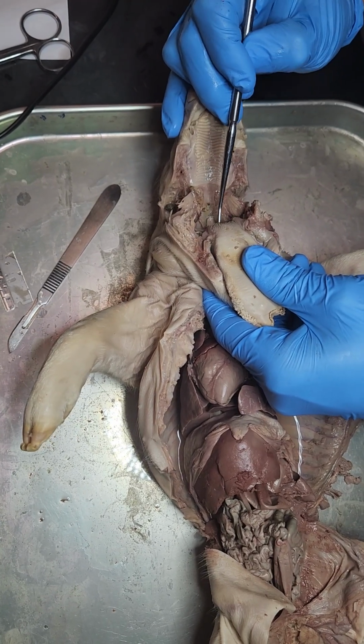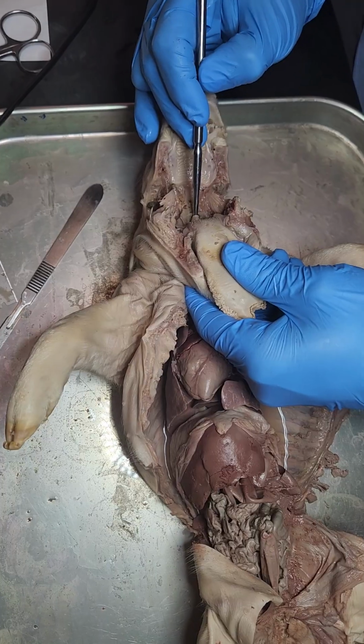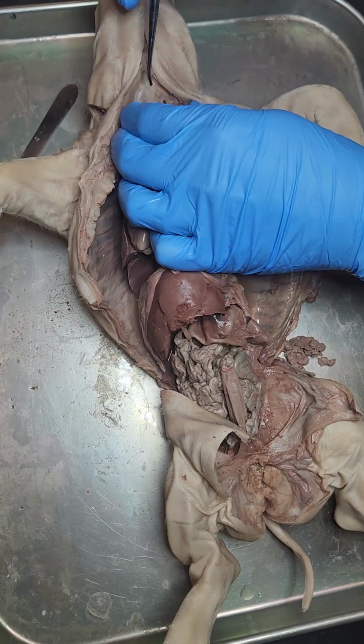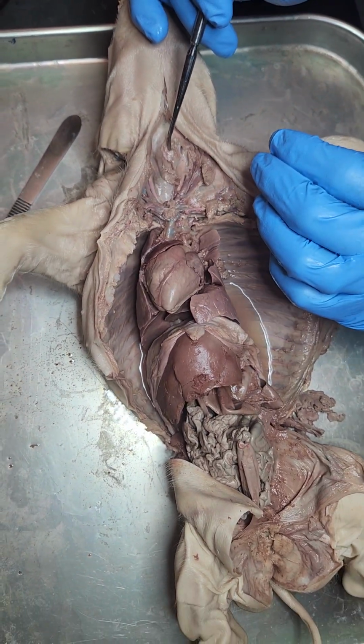This is the epiglottis. Remember, the epiglottis is epi means top. So when I go inside that, I'm in the glottis itself. Okay. Next is larynx. So this is your larynx. This is where your vocal cords are. That's why laryngitis makes it to where you can't speak well.